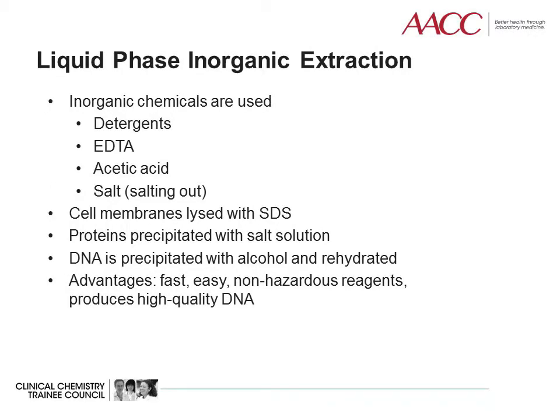Liquid phase inorganic extraction is advantageous because it is a fast, easy method, utilizes non-hazardous reagents, and produces high-quality DNA. The first step of liquid phase inorganic extraction is lysis of cell membranes with SDS. Next, proteins are precipitated with a salt solution. Finally, DNA is precipitated with alcohol and then rehydrated.